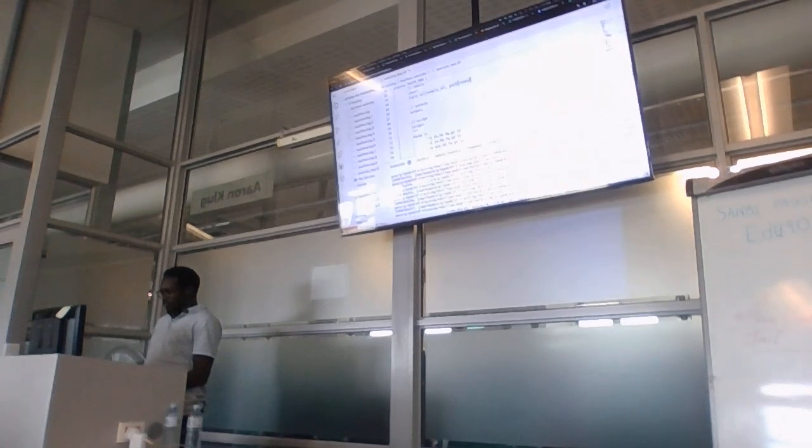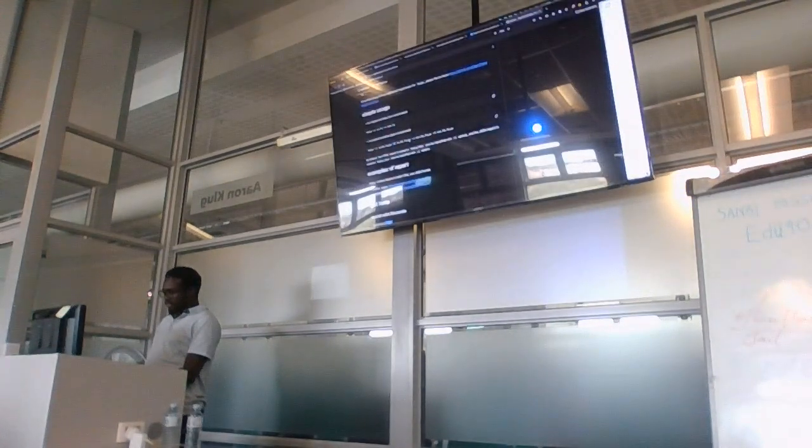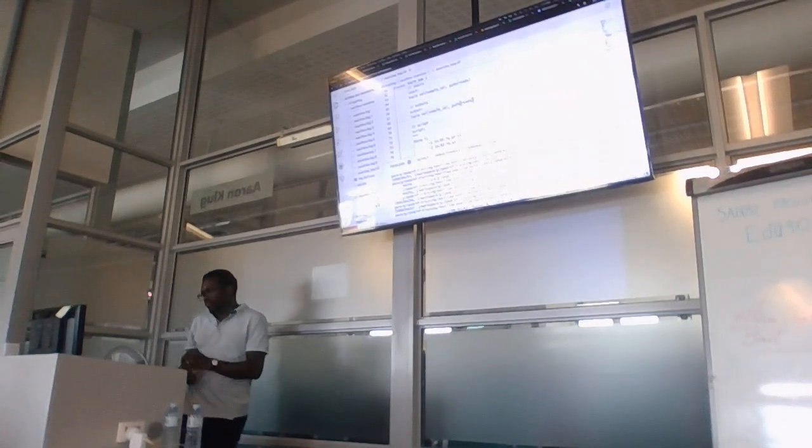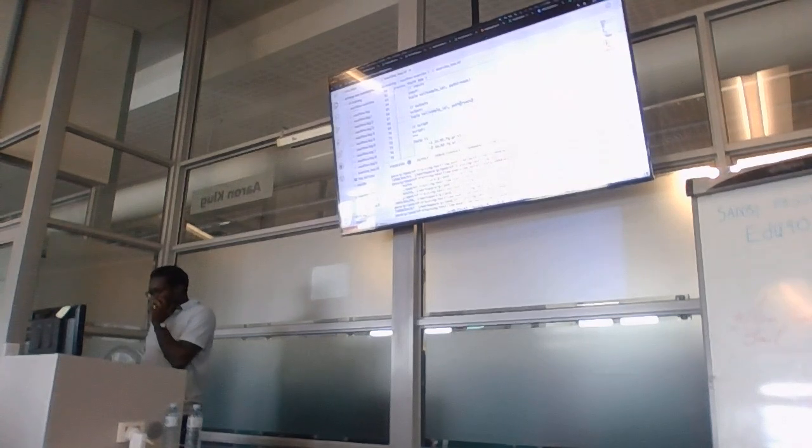So what we need to do now is we know that fastp is going to produce still files in FASTQ format. So we will still maintain the same structure, whereby we want the channel to have the sample ID and the reads as a tuple. The sample ID there acts as a key and the reads as the values.